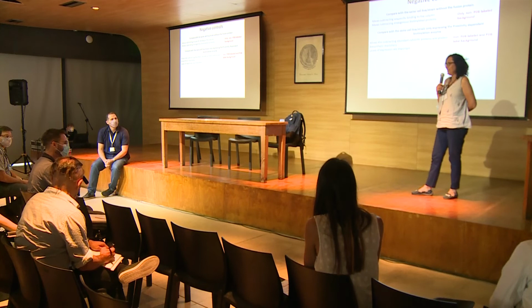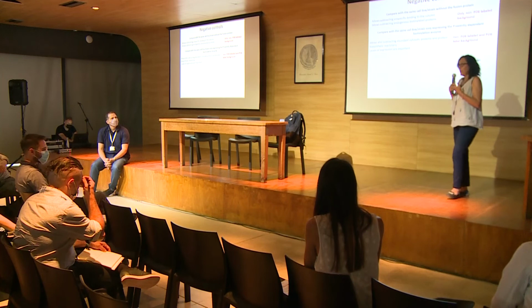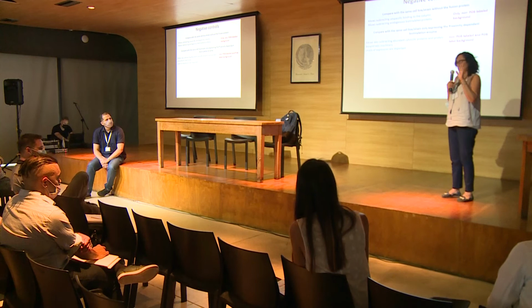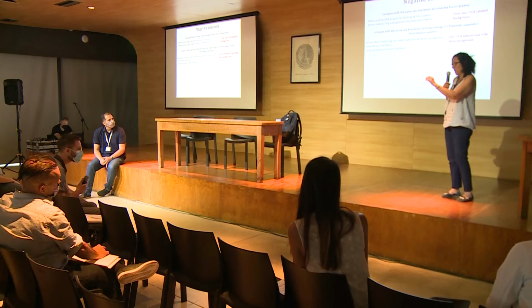Okay. In this type of experiments, I wouldn't skip the controls to save money because these are vital. The more you can do, the better. In our case, we are performing APEX, not BioID, and we don't use the wild type strain. Why? Because what we found is that when we use the wild type strain and we compare with the one expressing the bait, we have slightly proteomic changes, not just proteomic changes.